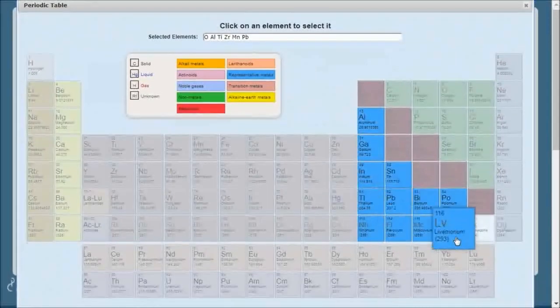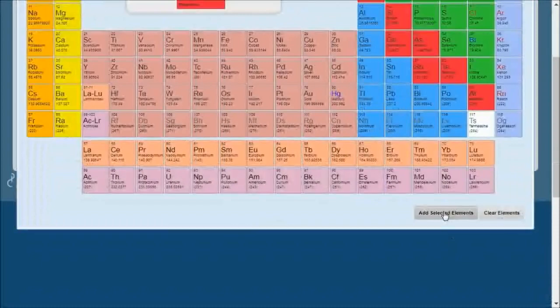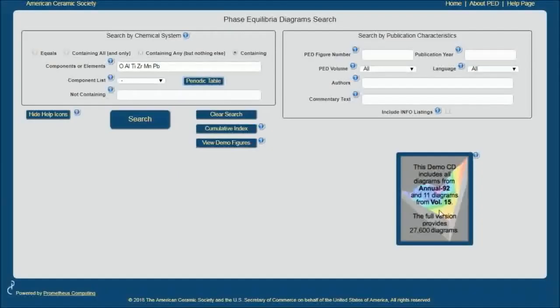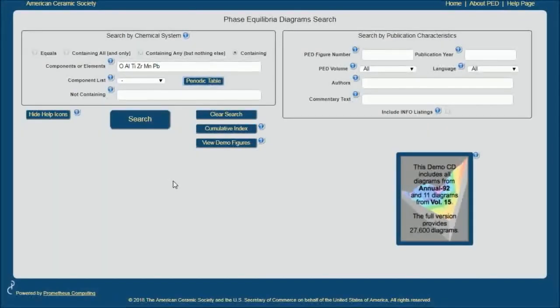Once I'm done selecting my elements, I click Add Selecting Elements, and here they appear. Now, if I were to click Search right here, I would get a very large number of Phase Equilibrium Diagrams.